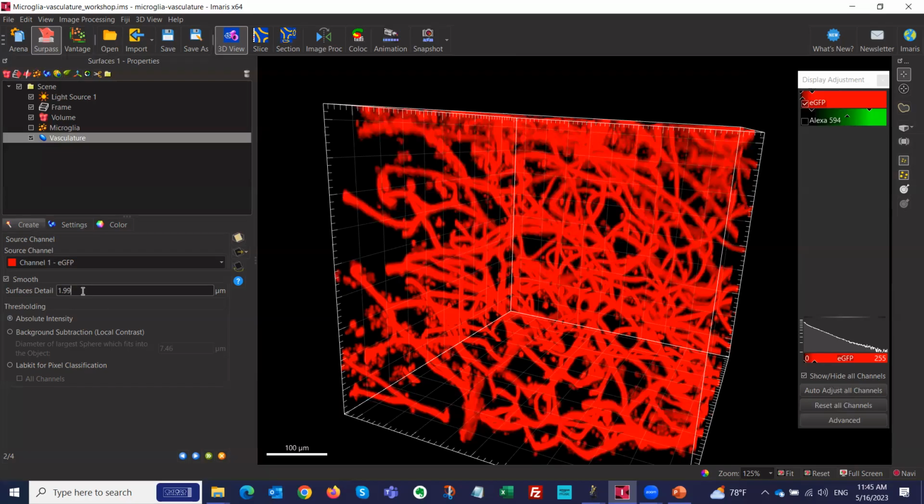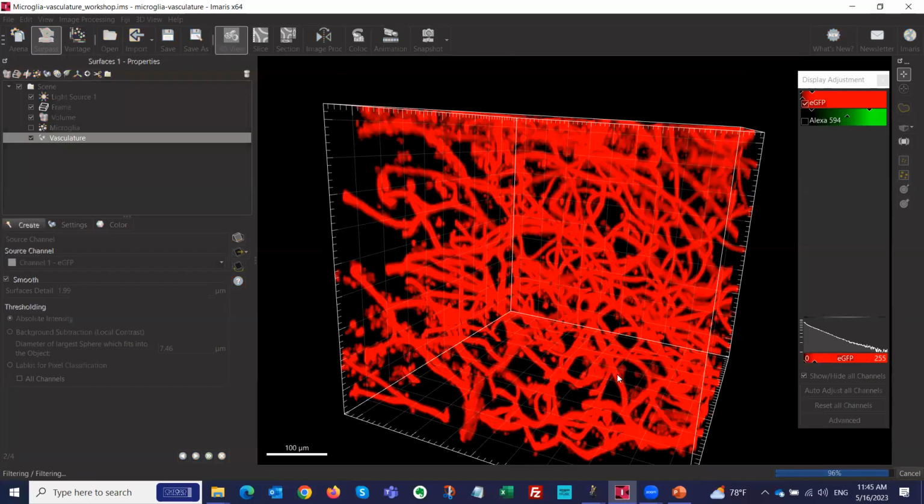This is obviously not always the case. Sometimes you have smaller objects that are like 1 pixel or even less. Sometimes, I mean, not recommended, but it happens. So that's when you want to change this, when your objects of interest are within the range of 2 pixels. What it means concretely, I'm going to show you in an example, because let's say I just don't change anything. I just go to the next step.